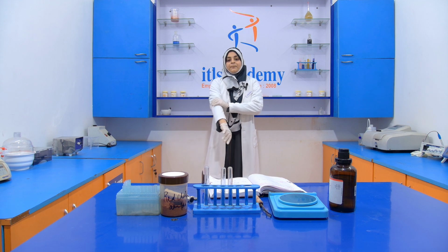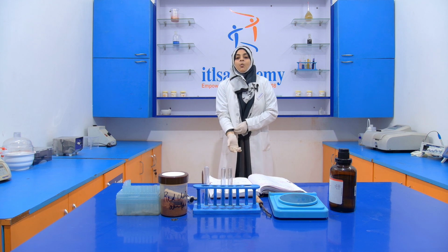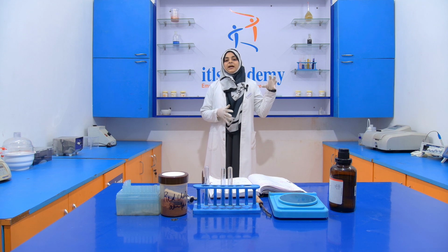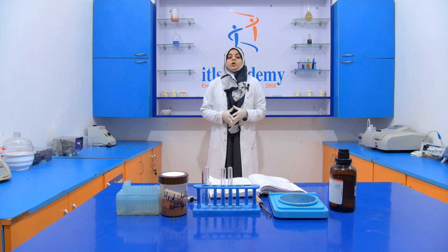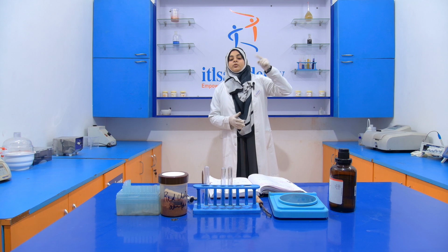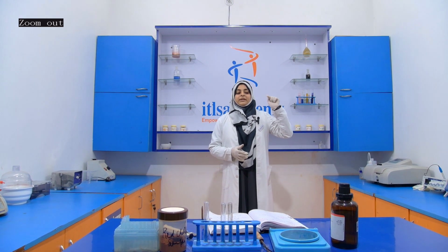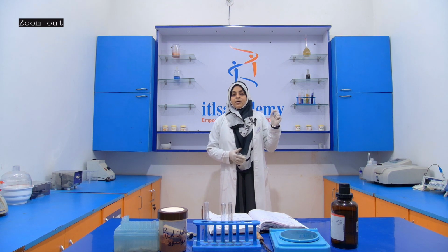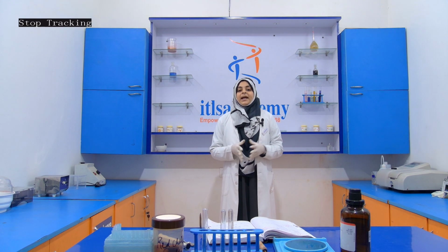Like for example, when you go to the market to buy guava, in a shop you see two types of guava. One is a brighter green color and the other is the normal, natural color of guava. But you will buy the brighter green one because it attracts you towards itself. You don't know that the guava is artificially colored, but you buy that artificially colored guava. Now let's start the experiment.